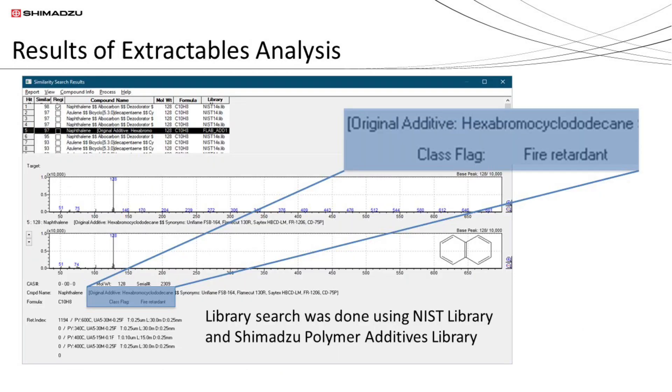The extractables identification was performed using NIST library and Shimadzu Polymer Additives library. The polymer additives library has additional information such as possible original additive name, if the detected compound is a breakdown of an additive, as well as the additive type, for example, a fire retardant.